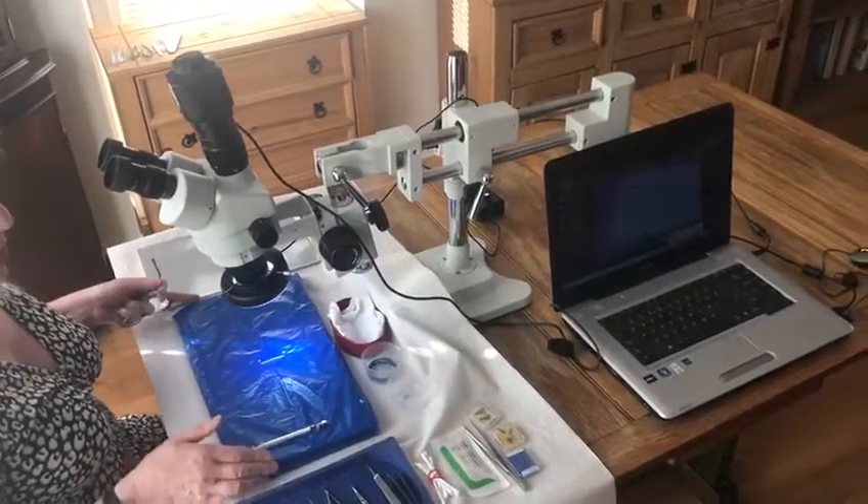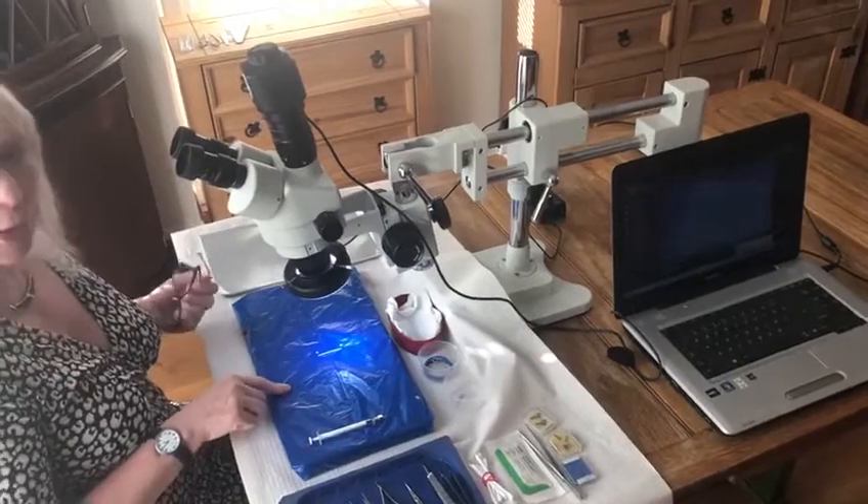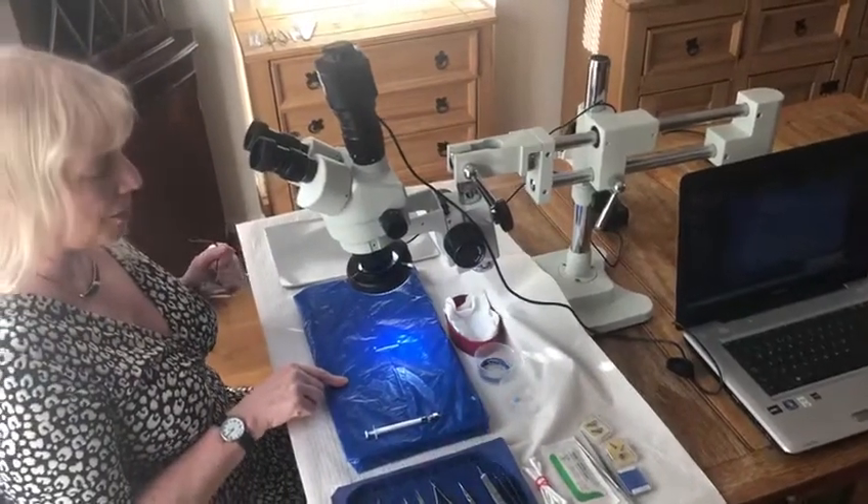Then you will need a suitable base to work on. Here we have a cork board just covered in plastic to keep it clean.